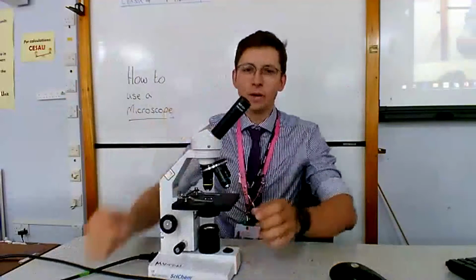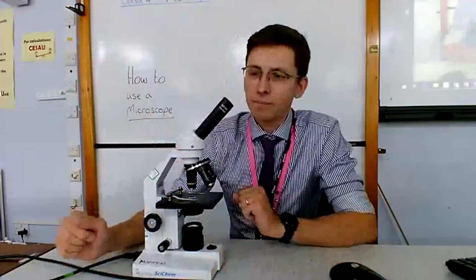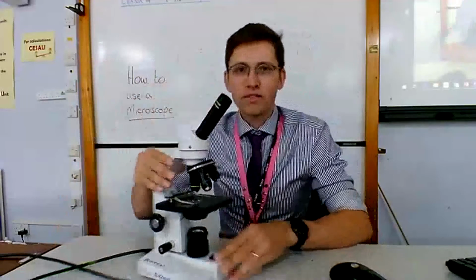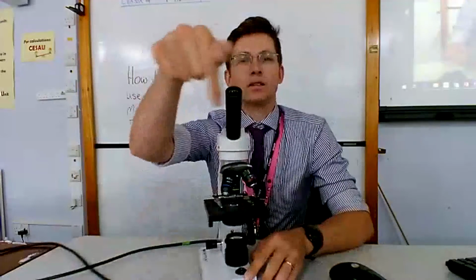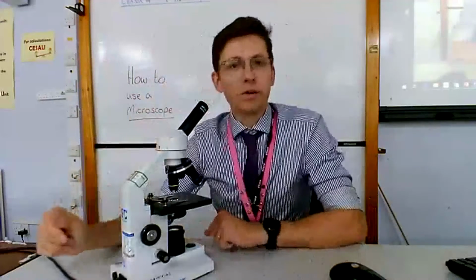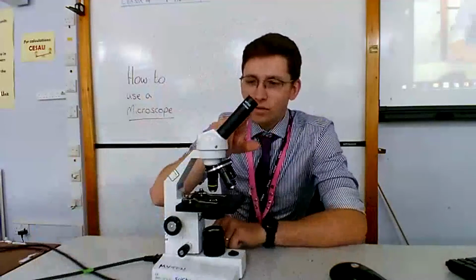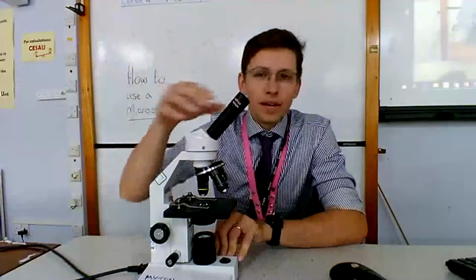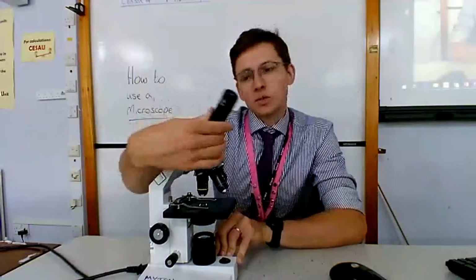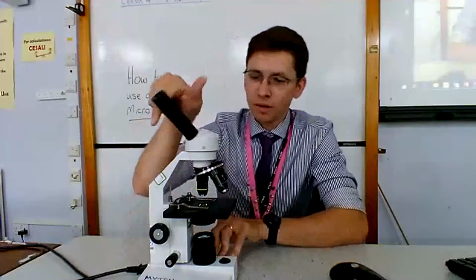Okay, now parts of the microscope. A lot of the microscope here is very expensive, so we have to be very careful with a lot of it. To start with, at the top, we've got something called the eyepiece lens. Okay, and it's called the eyepiece lens because that's the bit that we look through. That's the bit that the eye goes to. Further down from the eyepiece lens, and the eyepiece lens swivels round. So at the minute, we can't share microscopes, but if somebody else was to look at your microscope, without moving it, you could just swivel it round for somebody else to look at.